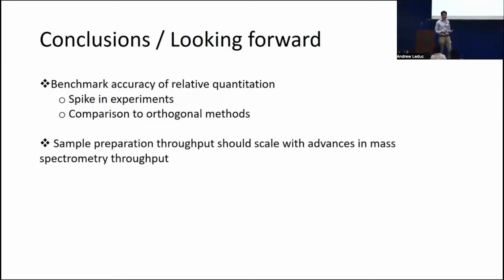We envision a future not so far off where we're able to analyze many more cells with mass spectrometry than we currently can. And, at this current point in time, the sample preparation is not the bottleneck for us in our lab, as it takes about several days to prepare all the samples from one of our sample preps. But we want methods that are able to easily scale as this landscape changes and as the landscape of labeling reagents changes, which we've all seen in past years.